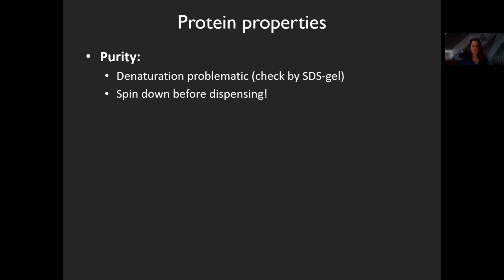Protein properties: of course, the protein needs to be pure. Denaturation is problematic. Check by SDS gel. If you've got the feeling that your protein is just decomposing as you look at it in its ice bath, it's not going to crystallize. Spin it down before dispensing. If anything precipitated prior to the crystallization attempt, you don't want it to go into the drop. It could be a problem for your crystallization. So gently spin the stuff down before you set up your crystallization plates.